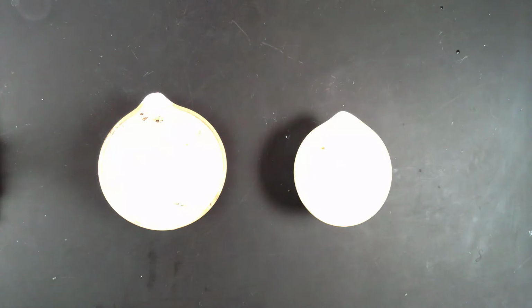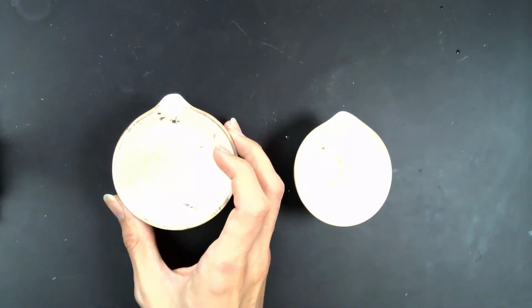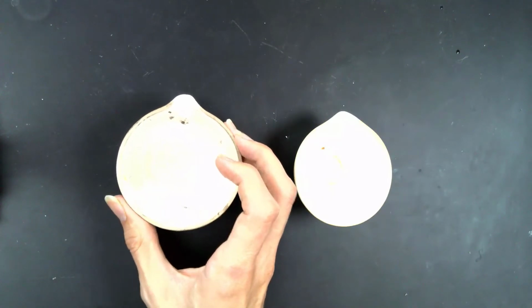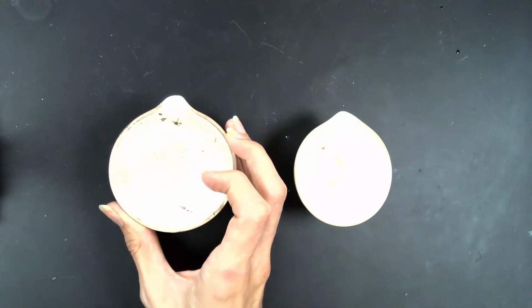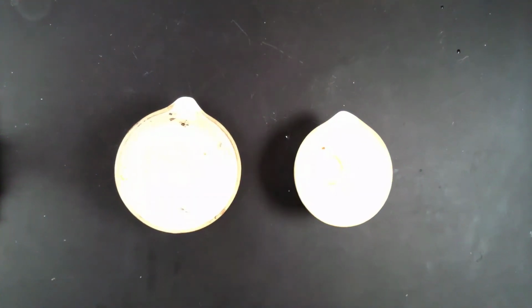Okay, so after completing the first heating, I've weighed my evaporating dish, and ideally during the heating period I drove off all of the ammonium chloride. So all I have left in my first evaporating dish here is the sodium chloride and the silicon dioxide. So it's just a mixture of salt and sand. And as I stated when we were looking at the flow chart, the idea is to use the fact that salt is water soluble to separate the salt from the sand.